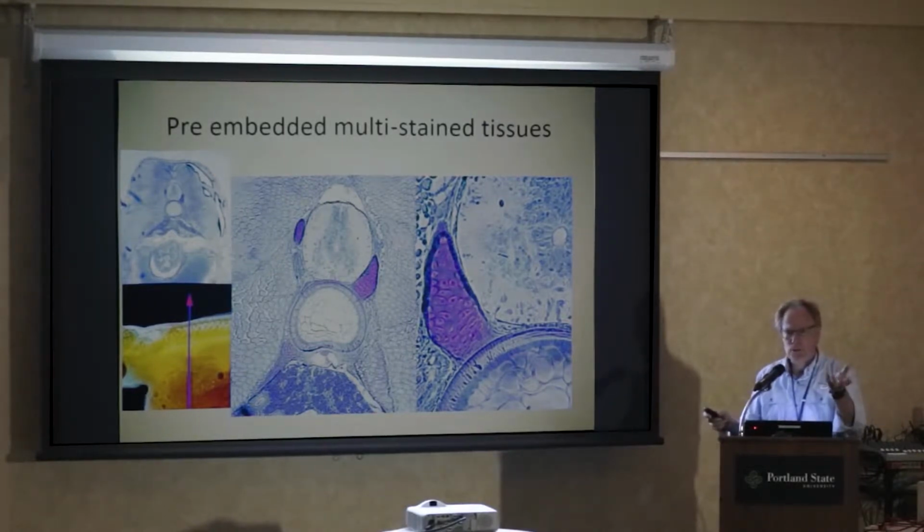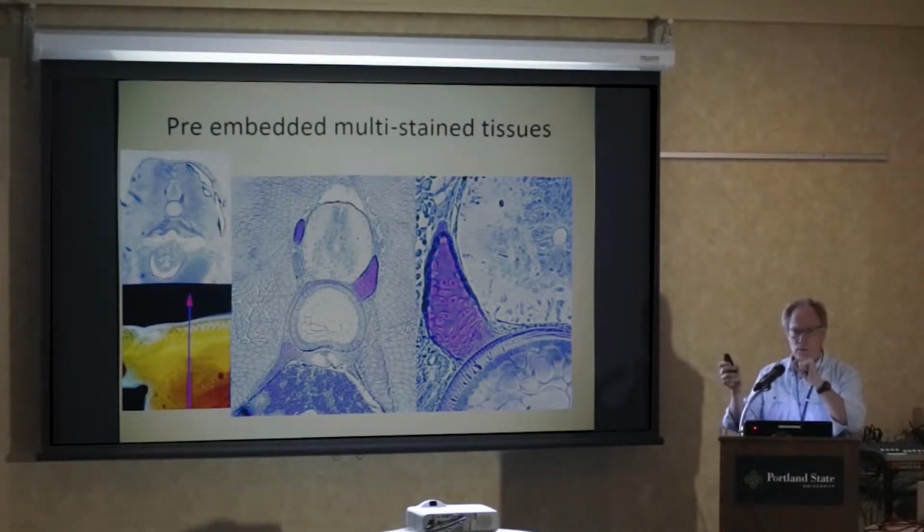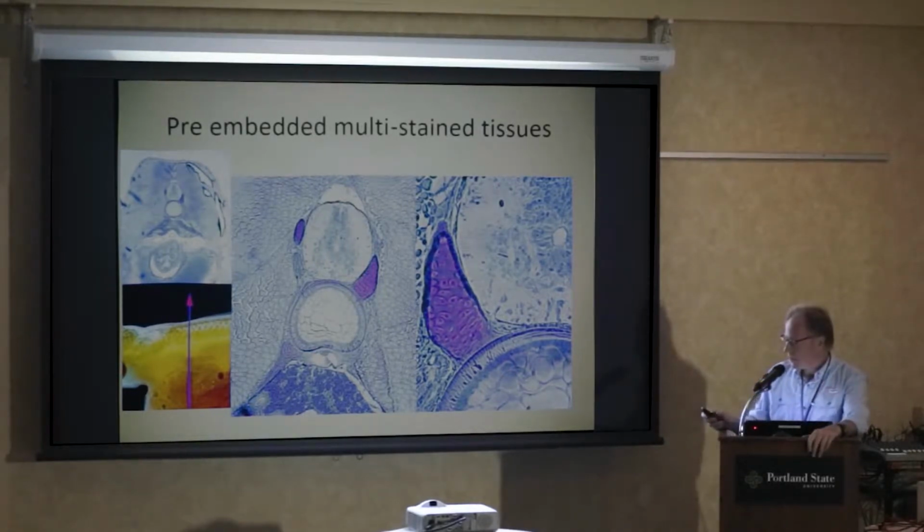We can culture zebrafish or medaka and fix them at various stages of development, multi-stain them, section them, and they can literally see the fate of these cells in, again, a low-cost version.